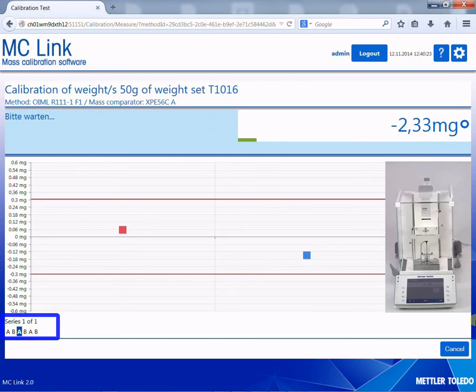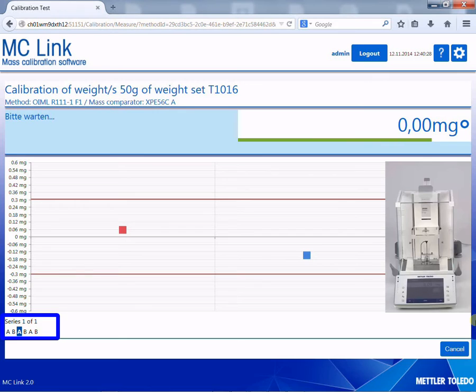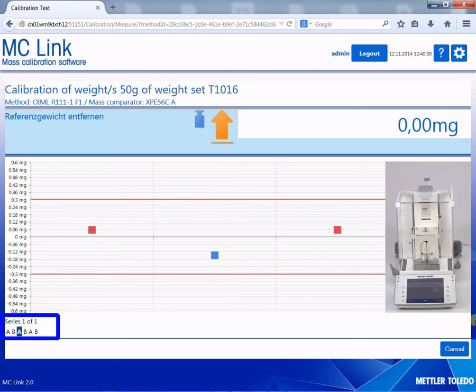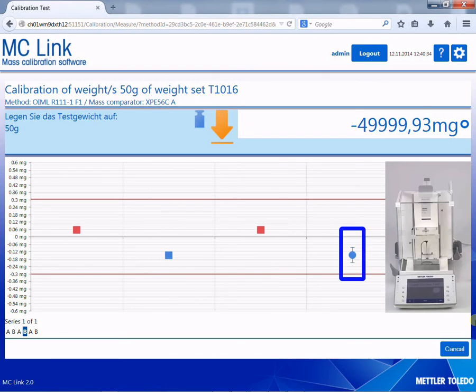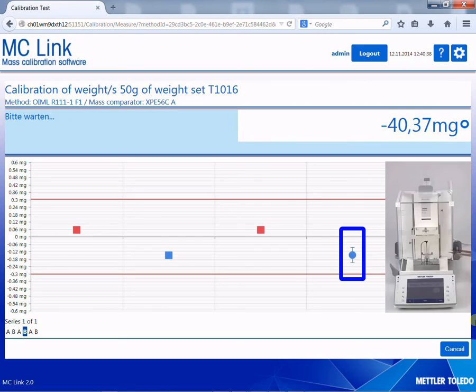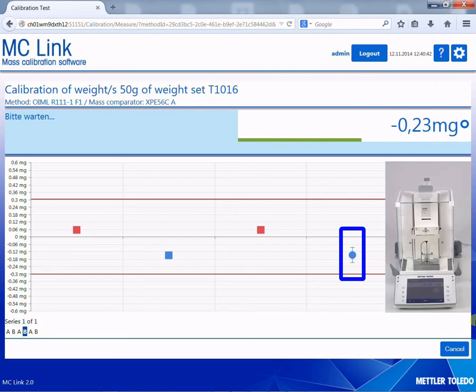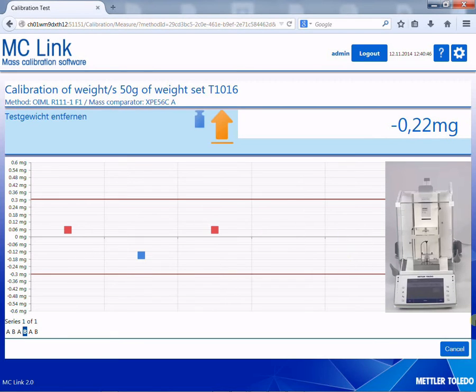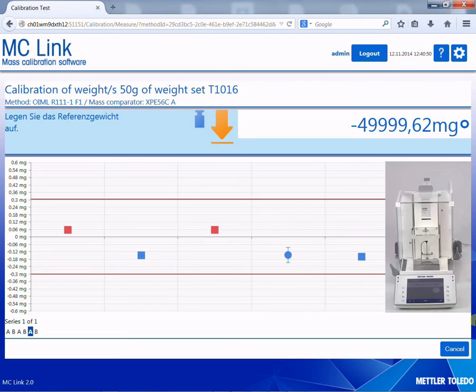The progress of the calibration is visualised, giving indications of the current process step and timeline estimations. Each finalised weighing scheme is calculated instantly, and the air buoyancy corrected conventional mass, including the corresponding uncertainty, is shown for visual analysis. Results exceeding tolerances are recognised at a glance, and consequences are triggered immediately to save time.